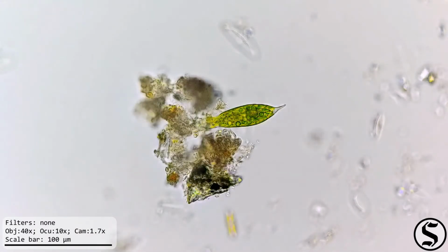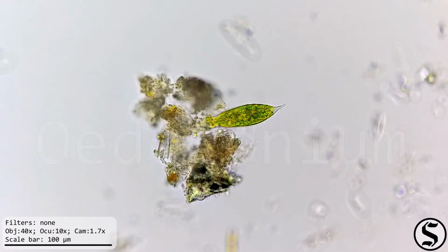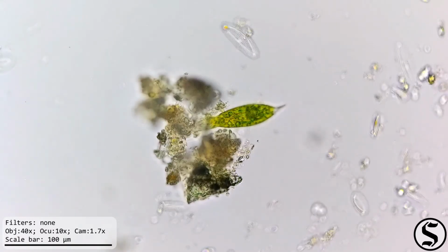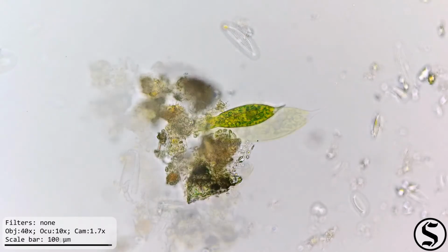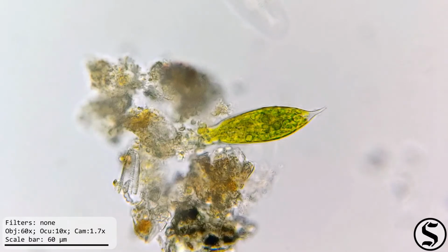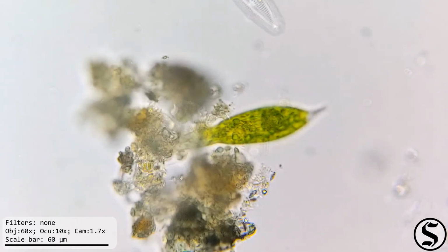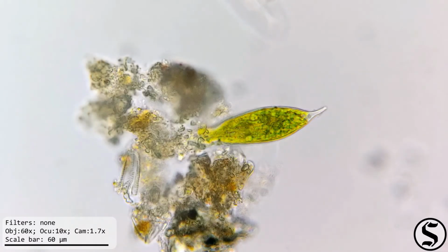And then this little candelabra bulb looking thing is algae of the genus Oedogonium. That comes from the Greek oideo, to swell, and gone, for seed. Can really see a lot of Brownian motion in there amongst the chloroplasts. This looks to be a germling, the start of a filament.